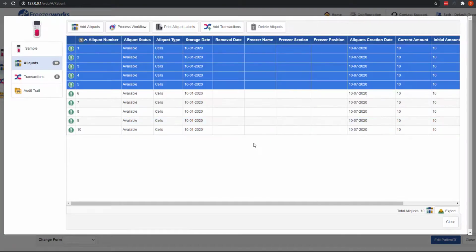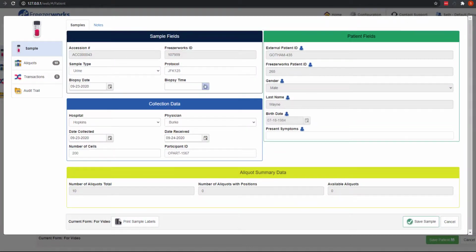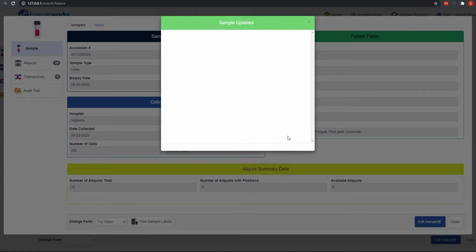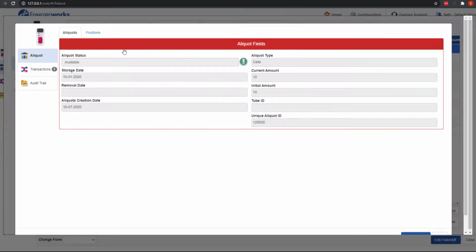If you haven't yet seen our series on samples entry on the web client, I highly advise you do so. I glossed over a lot of material that's covered in detail in those videos. Otherwise, our user's guide has topics on everything, and our support staff is always ready to help too.